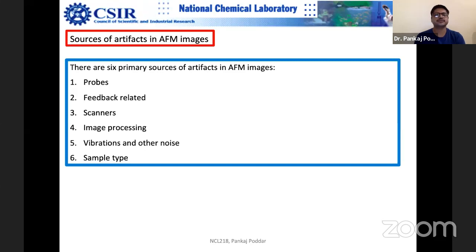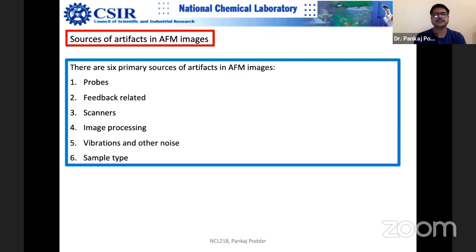Third and quite important is the scanners. Scanners are piezo tubes, and they have their own artifacts and problems. Fourth is image processing. Even if you have captured the image nicely, when you start processing it — doing flattening and other steps — one may introduce a lot of artifacts. The last thing is vibration and other noise. For example, building vibration can be picked up by the instrument and you can see a lot of problems.